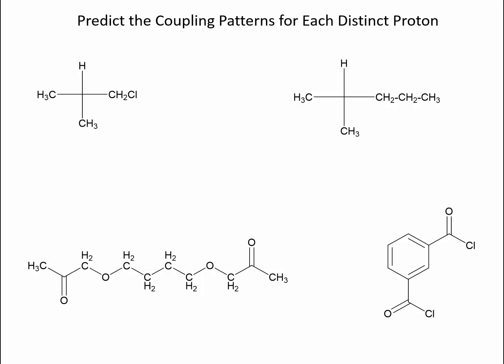In this first one, what we're going to see is that these 3 hydrogens, these 2 methyl groups, are equal to each other. Their signal is going to add together to be intense enough for representing 6 hydrogens, but if you look at this carbon and what we would call the adjacent carbon, there's only 1 hydrogen total. Therefore, these methyl groups are going to appear as doublets, 6 hydrogens. This hydrogen here is split quite heavily.